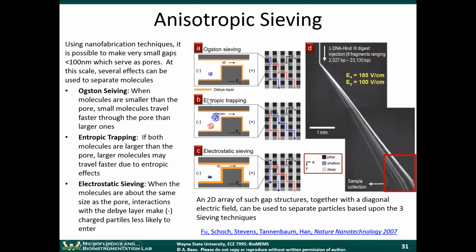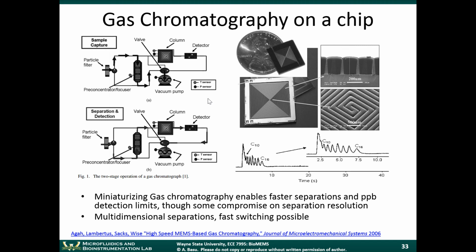Because we're out of time today, we're just going to skip over gas chromatography. I added this today; it's not in your earlier version of the notes. Just for information's sake, gas chromatography is another technique used to separate gases in the gas phase, and that's traditionally done with a large instrument. But there's been a lot of recent effort in the last 10 years or so, and this was done a lot at the University of Michigan, where I was a grad student, to miniaturize gas chromatography systems.